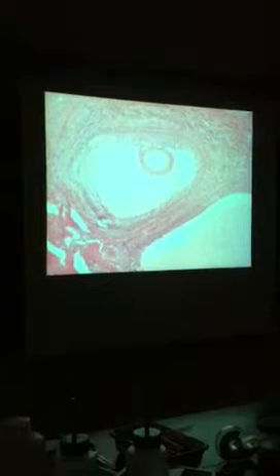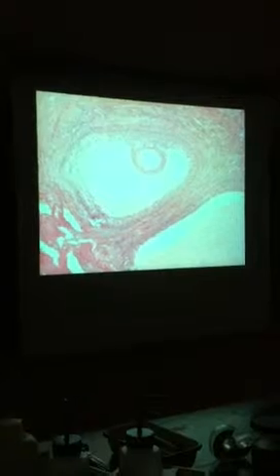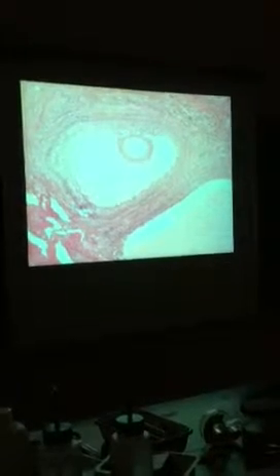But this one doesn't have any Graafian follicles. Oh, there's one right there. So again, that entire thing at the end of the pointer would be the Graafian follicle. The space would be the antrum. The cumulus oophorus, that little section at the top. Corona radiata, then the zona pellucida, then the oocyte. Look at that. It's huge.